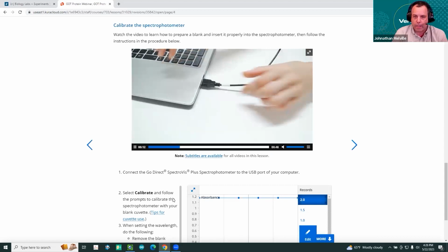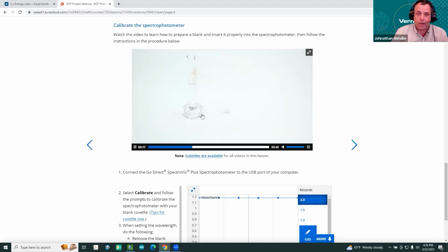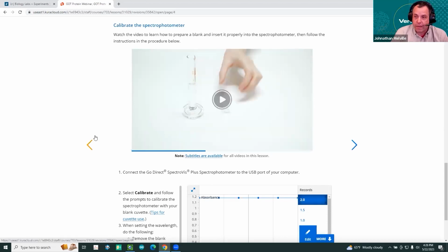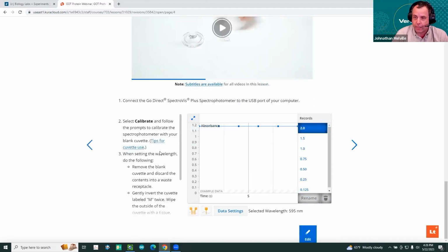Don't worry, I'm not going to make you watch a full minute of this video, but I wanted to let you know that the video's there. One of the key things about this lab in particular is the blank that you wind up using. The blank in this case is going to be unreacted Bradford.